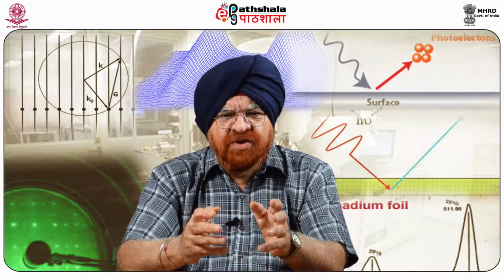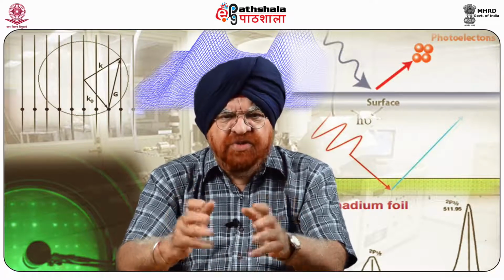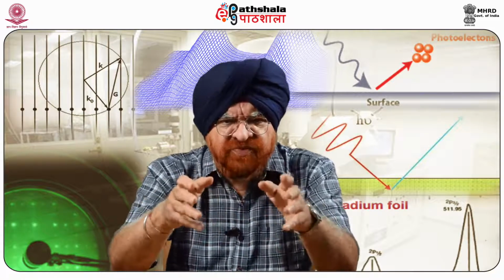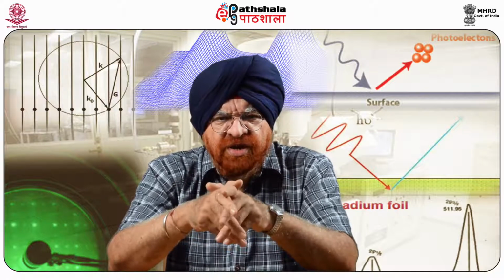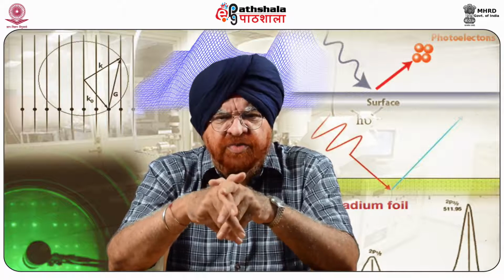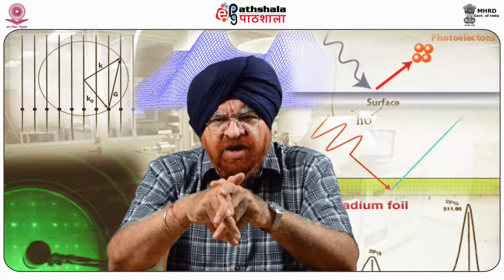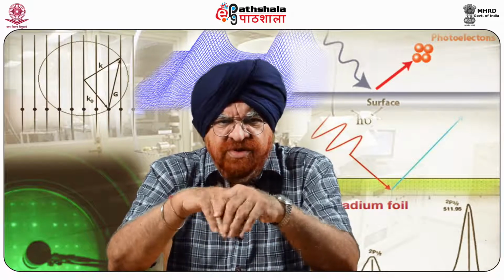It is able to study covering areas on electrode surfaces, metal deposition, charge transfer, potential-dependent surface morphology, corrosion, batteries, semiconductors, and nanofabrication. Having known so many applications, one can immediately realize the importance of this equipment. Events in the electrochemical data correlate with changes in the topography of the sample surface.